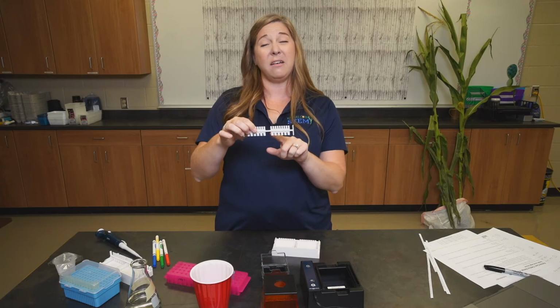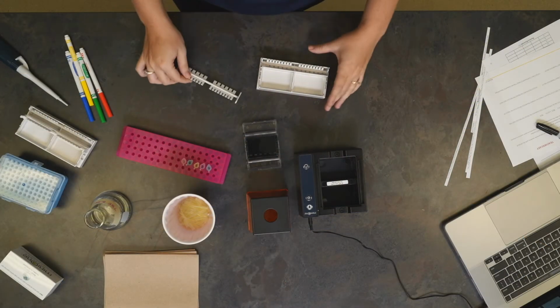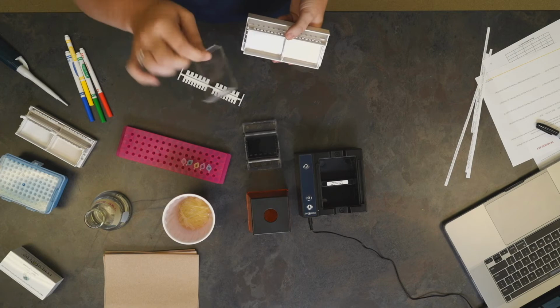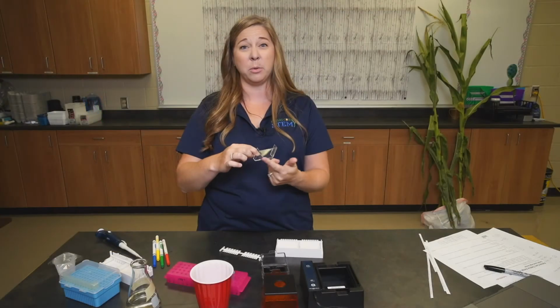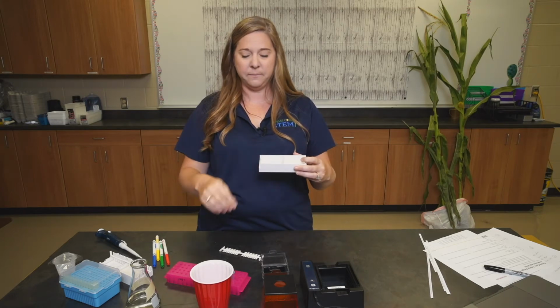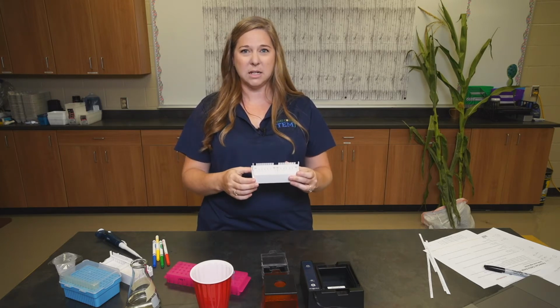Today we only have 5 samples, so we're going to use the larger wells down here. The other great thing about this is the tray itself. In the past, we would always have to tape or add rubber bumpers to the edges of this. But now, because it has a molding tray, it slides right in. We pop in the comb, and we're ready to go.